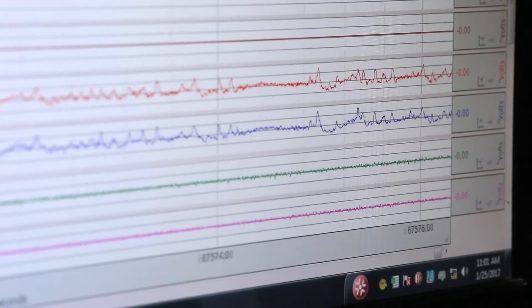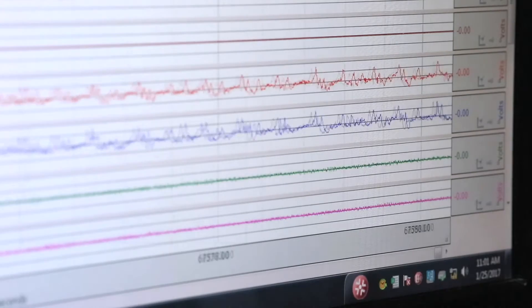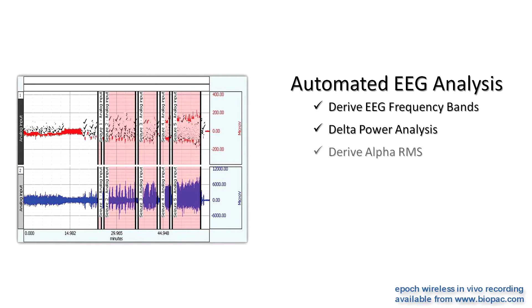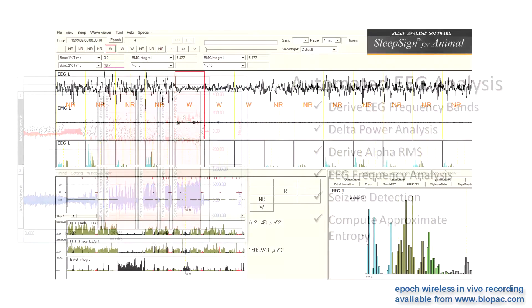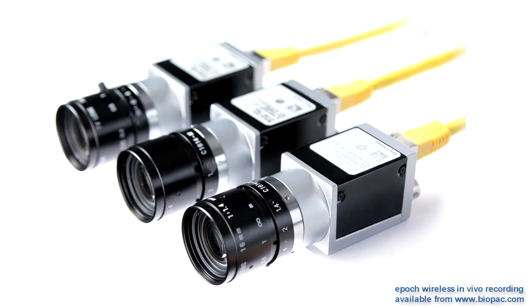After recording, automated EEG analysis routines quickly score multiple channels of EEG data simultaneously. AcqKnowledge guided automated routines can be used to derive frequency bands, complete a frequency analysis, look at alpha-RMS, and more. Epoch and Biopac also easily integrate with sleep analysis software and video monitoring.